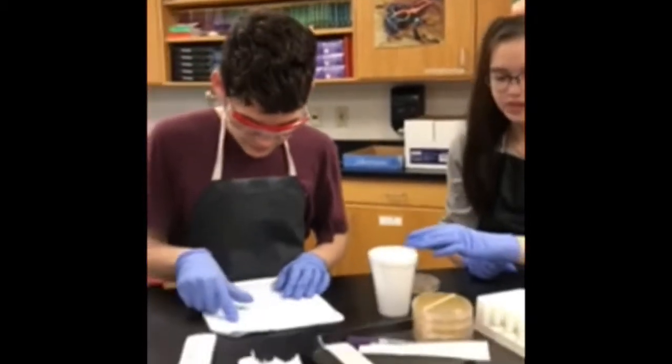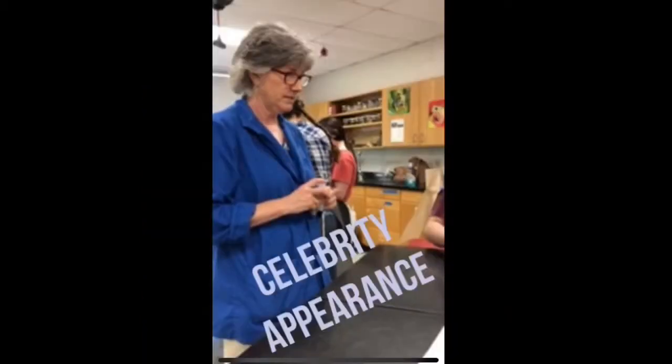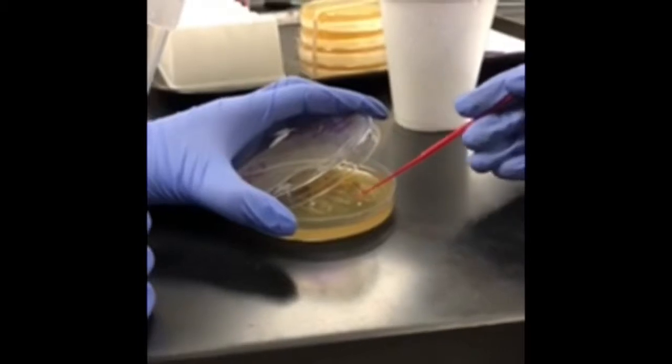Return the plus plasmid tube to ice. Repeat steps 4 and 5 for the minus plasmid tube with new sterile tools.